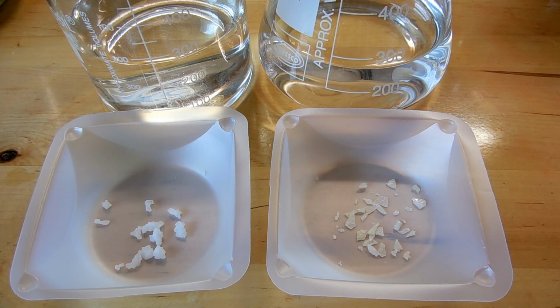Hey everyone! Today's video is a very cool experiment that's a pretty common demo in chemistry classes called the Golden Rain. And this is going to be a combination of potassium iodide solution and lead nitrate solution.